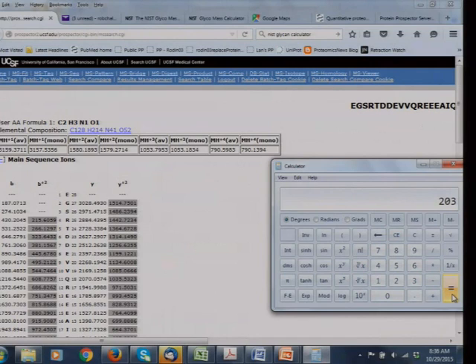The reason is they're normally releasing the glycans and then trying to analyze them. If you've got a single HexNAc, that's not retained on any of their systems. It just flows through because it doesn't bind, so anybody doing glycan analysis never finds these very small structures because they come through in the void volume in all the chromatography they do.